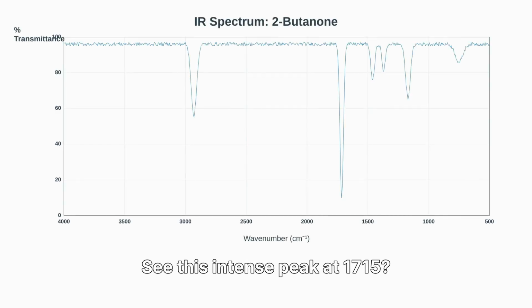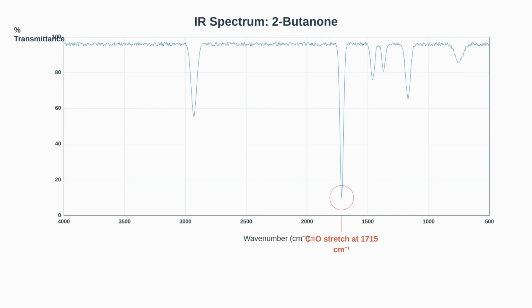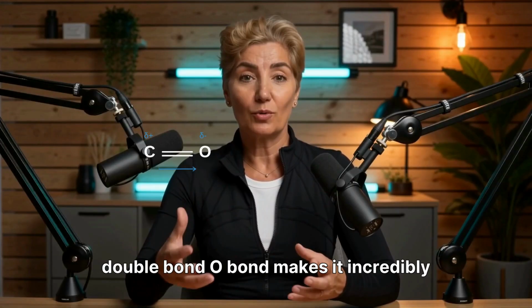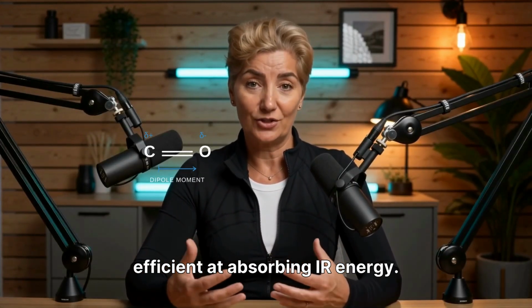See this intense peak at 1715, that is the classic C=O stretching vibration. Why is it so strong? The large dipole moment of the C=O bond makes it incredibly efficient at absorbing IR energy.